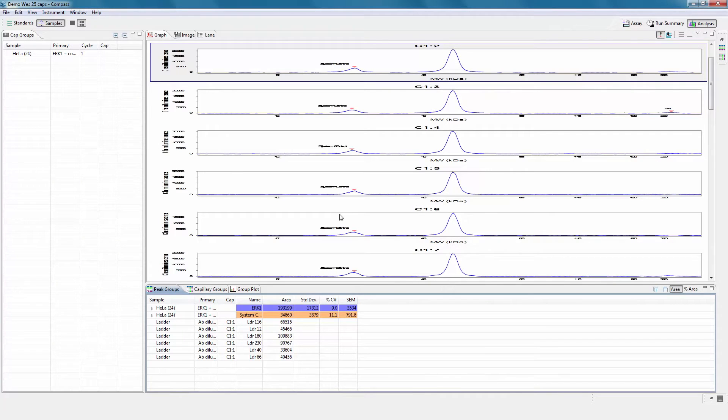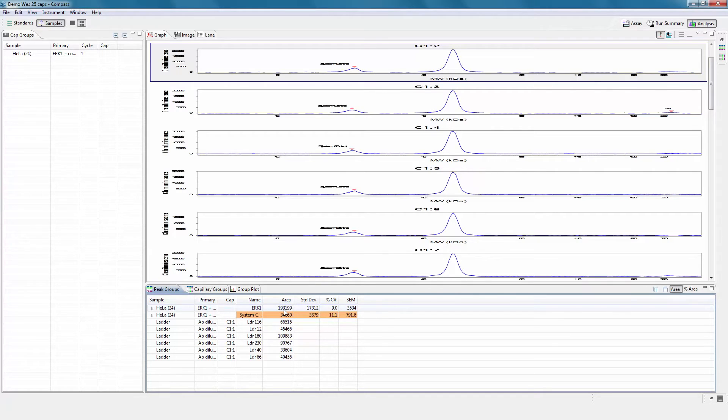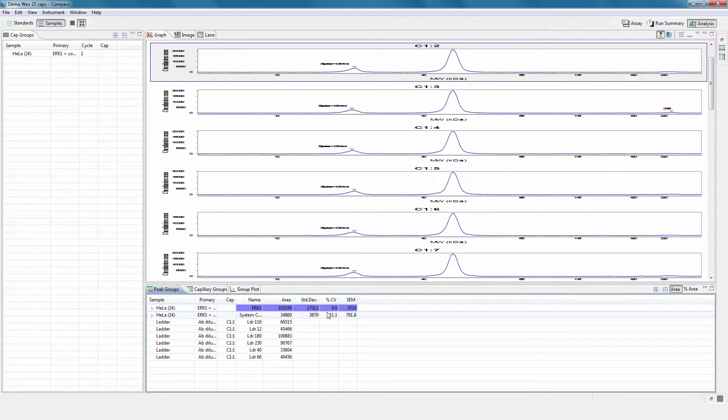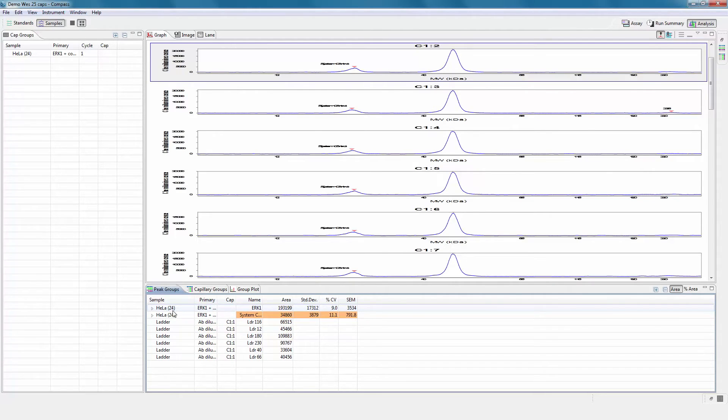The peak groups window reports statistics for each named protein in every group, which includes average area, standard deviation, and percent CV. The number in parentheses after the sample name indicates the number of capillaries in the group.